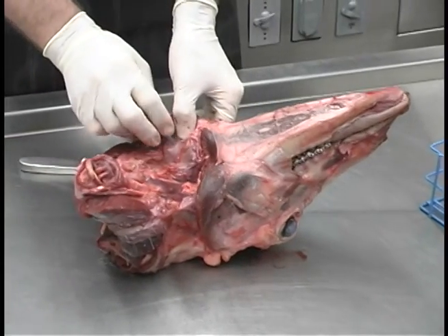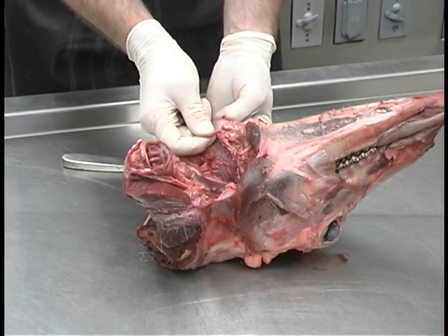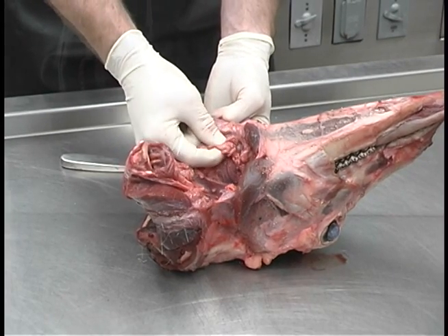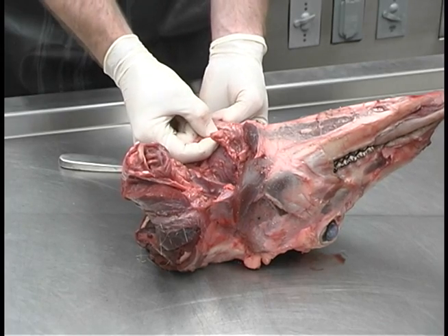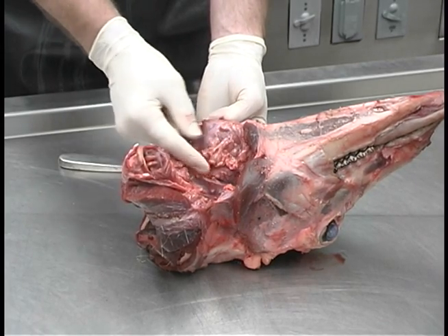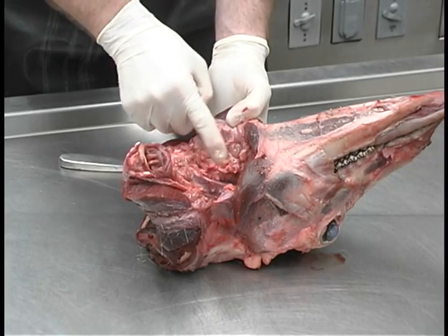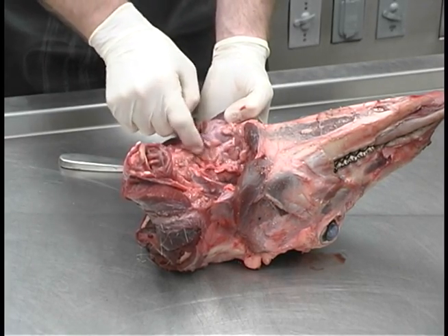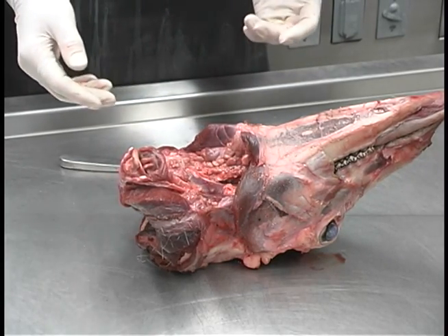Now this tissue on either side of where the lymph nodes were — kind of lumpy tissue — this is salivary gland. This is not suitable for chronic wasting disease testing. You do not want to submit this in place of the lymph nodes. It has a rough appearance and it feels lumpy when you rub your finger over it.